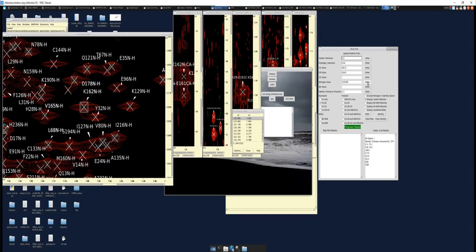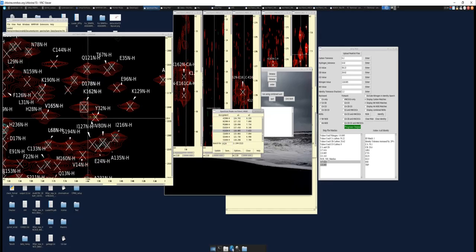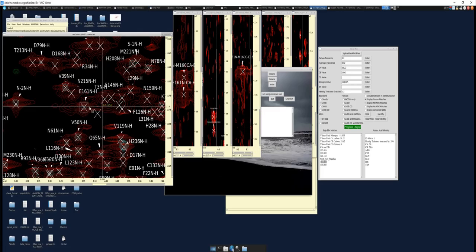So let's just enter all of these, and we'll just use the C alpha, C beta. That should hopefully only give us 1 match. Oh, okay. It gives us 2 potential matches. I wonder if we can narrow that down with the NOEs. Let me clear. Yes, so we can narrow these 2 potential matches with the NOEs, right? So if you look here, since this has been assigned, the NOE matches quite nicely. So 117.416. So we go here, and now we immediately have the nitrogen-hydrogen values for our APS.